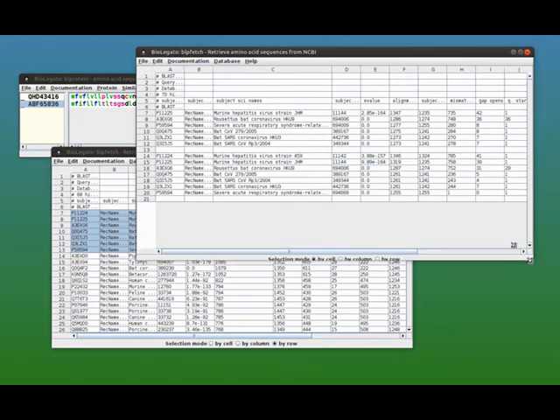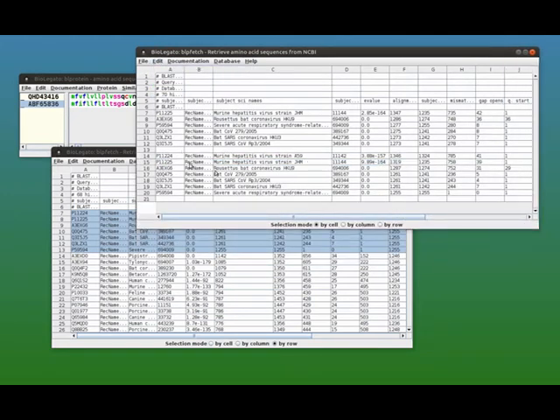So if we open up this window, you can see we've got both sets of hits, and there are some duplicates like this one and this one are duplicate. That's not a problem. Those will be eliminated before the hits get sent to NCBI for retrieval. So now we're ready to retrieve our sequences.